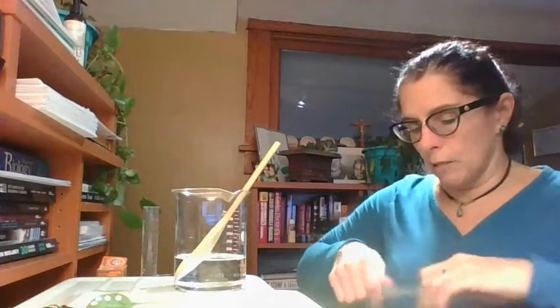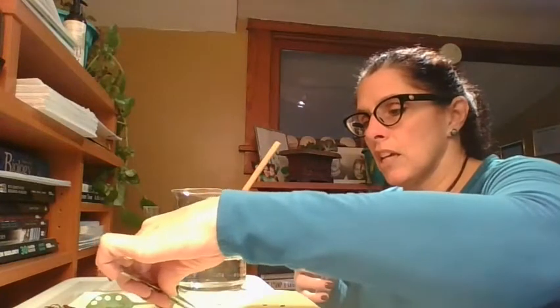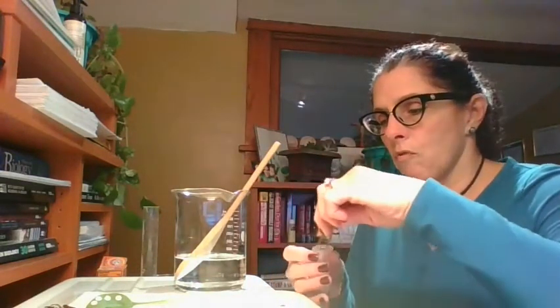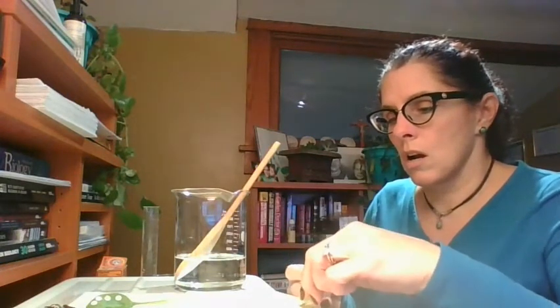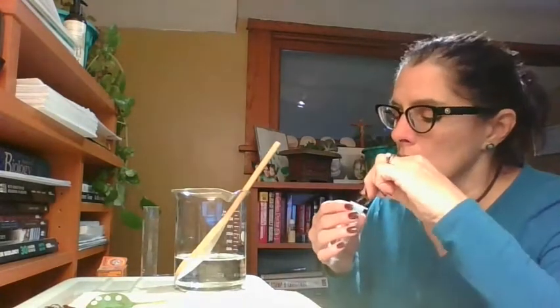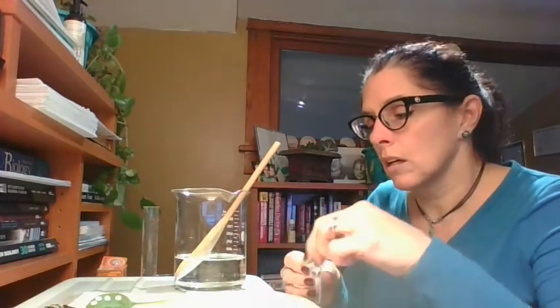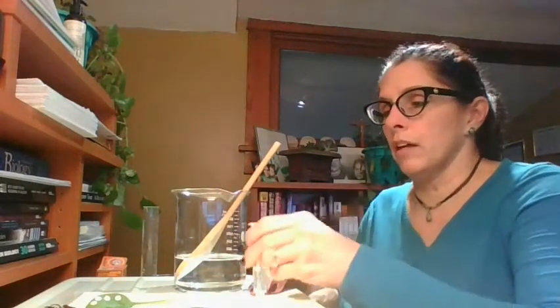All right, so my job here is I take the plunger off, and then I take my leaf pieces that I made and drop them in. They don't like to go in. 3, 4, 5, 6, 7. That was 7. That was 2, 8, 9, 10. Okay, so they're in there.